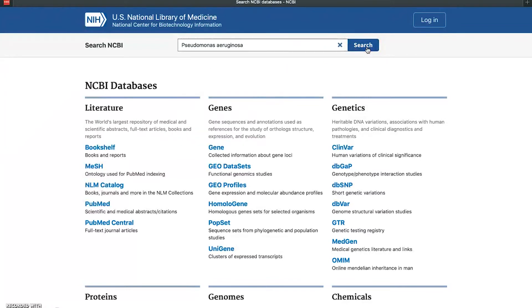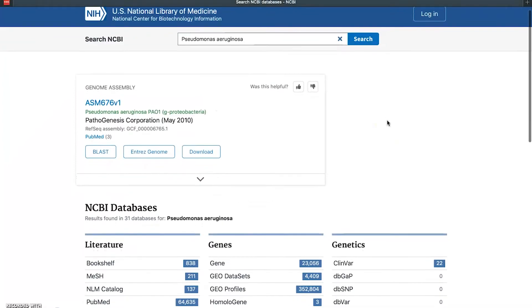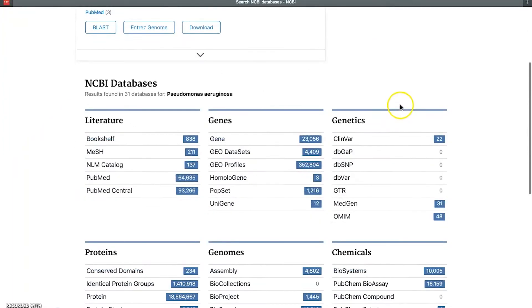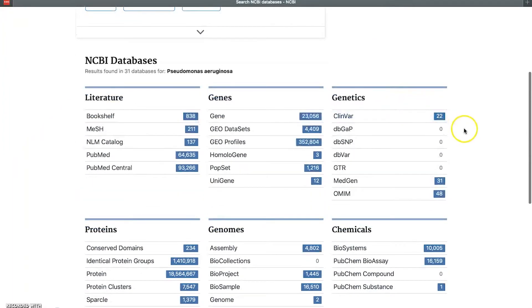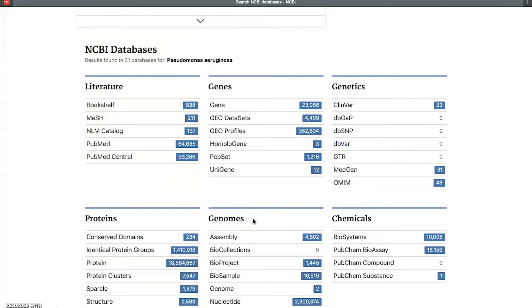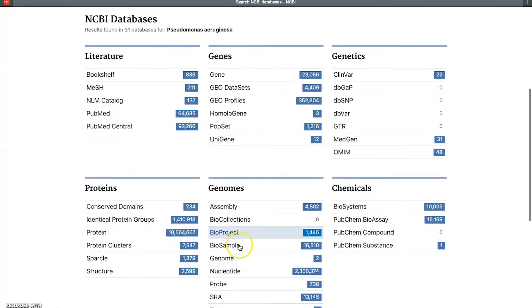Basically, what we want to do here is search for Pseudomonas aeruginosa, and we're going to type in this particular strain. We'll do a search on that and see what it brings up. If we scroll down just a little bit here, we'll see that it's populated these different categories. The one that we're most interested in is under Genomes, and if we go down to Genomes there is a subcategory called Genome singular.